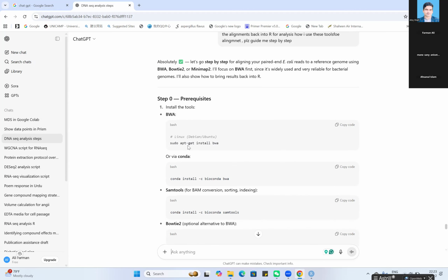So you need a Linux or other tool. Write a message here. Again, write a message. I am not familiar with BWA, Linux, Ubuntu.